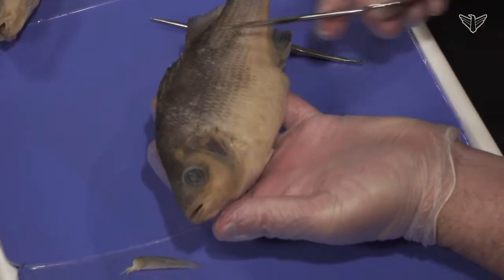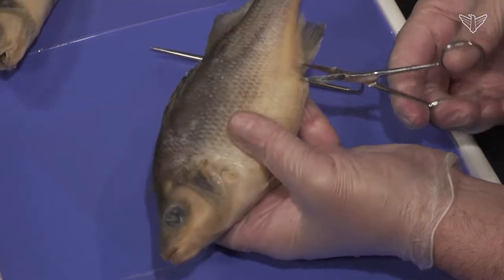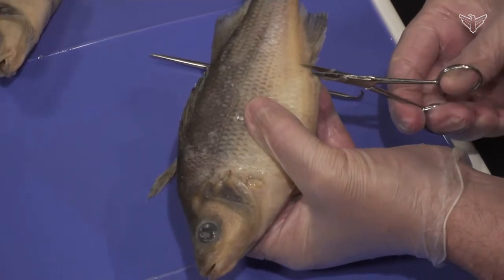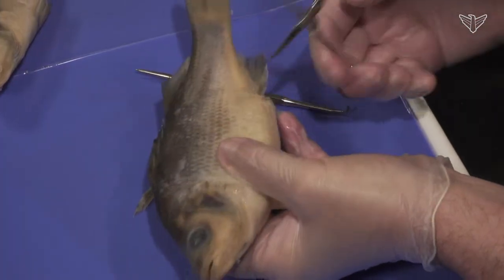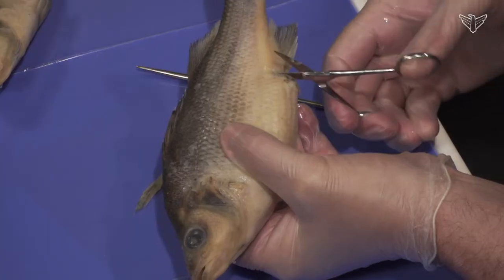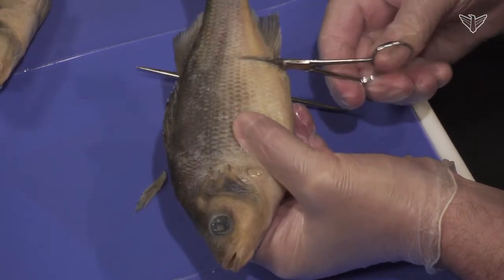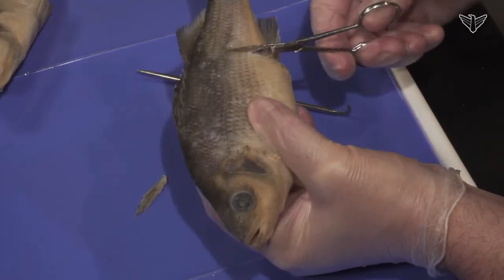As you hold it usually facing you, you want to cut this structure out here. I usually start at the cloaca and go in. Scalpels are okay, but I like to use scissors because you can feel that body wall and push up against it with the lower part of your scissors, and that way you can prevent yourself from cutting too deep. You can hear those scales — they kind of crunch.